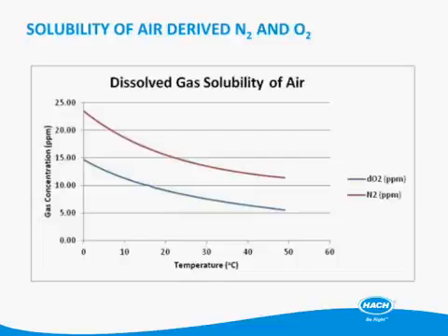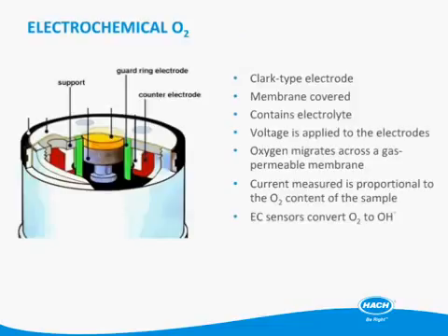To take a little bit of the theory and talk about solubility, and also start to apply it to the brewing process, I want to show a graph here. This graph shows air, 80% nitrogen and 20% oxygen, and how much of the different gases dissolve into liquid. If we take our gas component that's 80% nitrogen and 20% oxygen and dissolve it in the liquid, what ends up in the liquid is 60% nitrogen and 40% oxygen. That's because the liquid has a much higher affinity for oxygen than it does for nitrogen. I want you to think about this a little bit because we'll come back to it when we talk about wort and wort aeration.